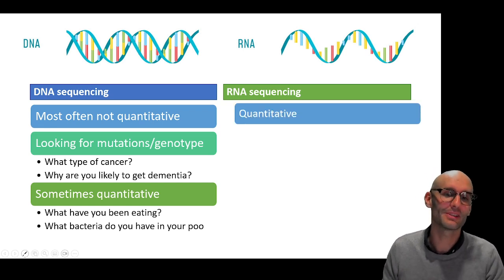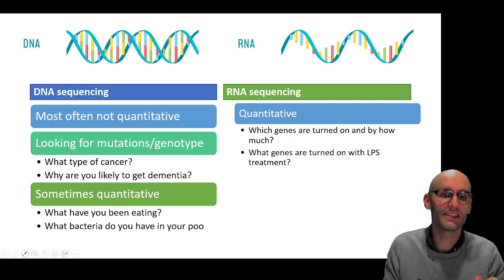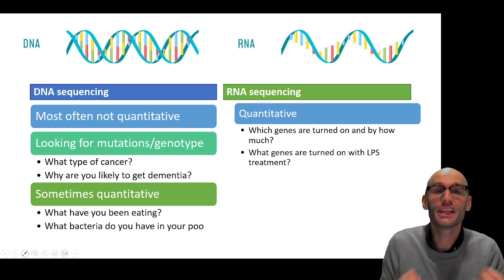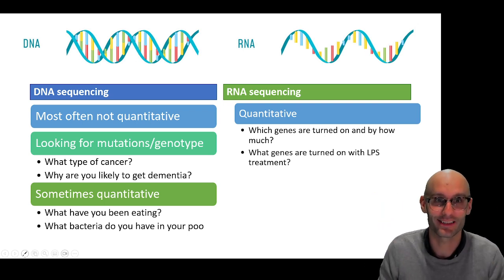So with RNA sequencing, it's almost always quantitative. We want to know how turned up all those genes are. And so which genes are turned on and by how much? An example might be, if I inject you with a bacterial toxin called LPS, what genes are turned on and by how much? You might expect a lot of inflammatory genes to go up, like cytokines, for example. So we can measure all the cytokines simultaneously, which is quite amazing.